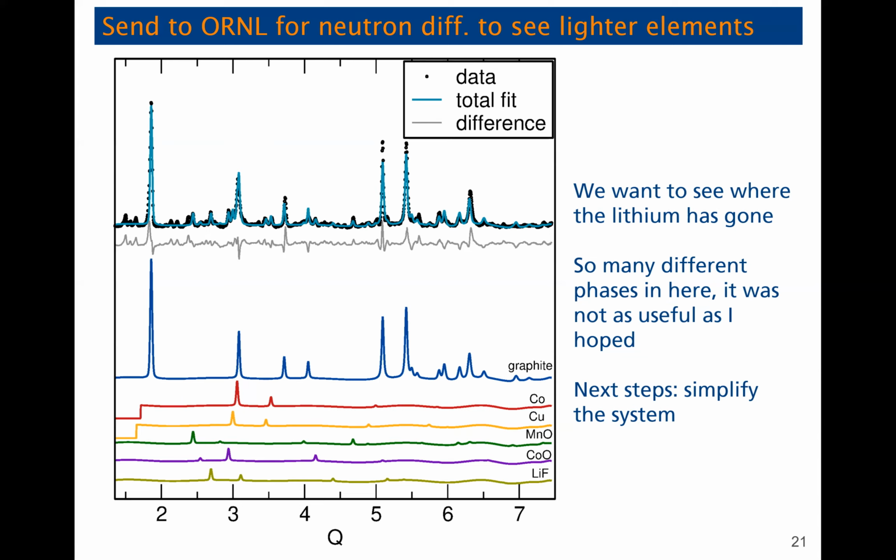Can we take just a few of these elements, like say just the lithium cobalt oxide and the graphite together? If we put those two things through the same set of processing that the recycled material went through, what phases do we get out of that? And then can we more confidently match those to the complicated material, which is like all of these mixed together?